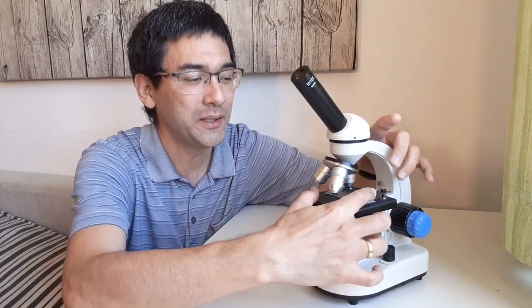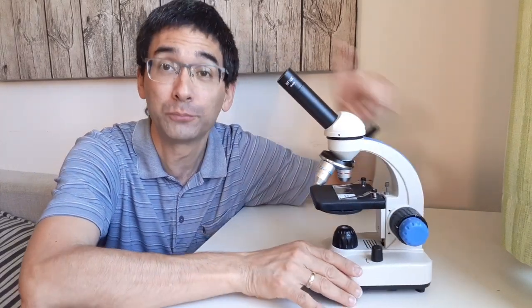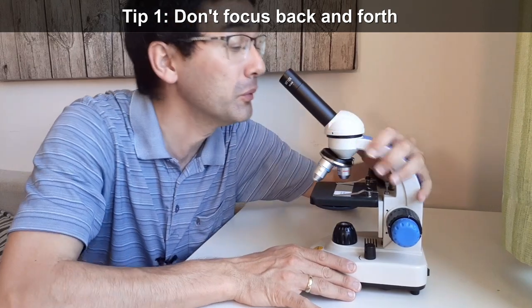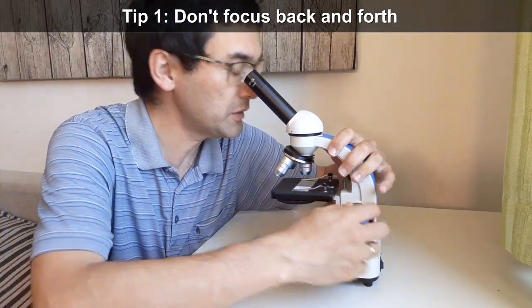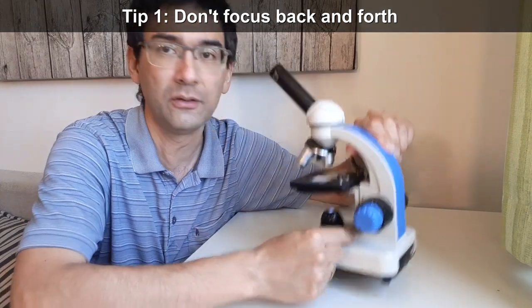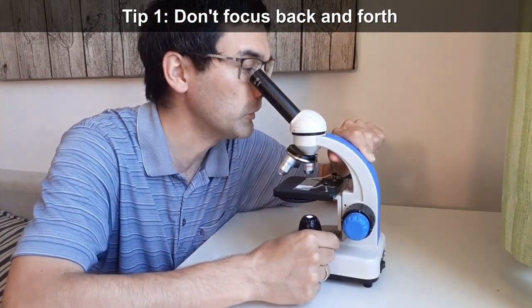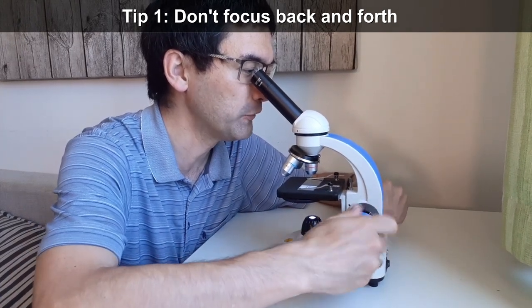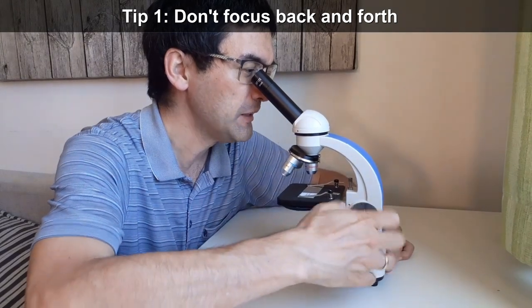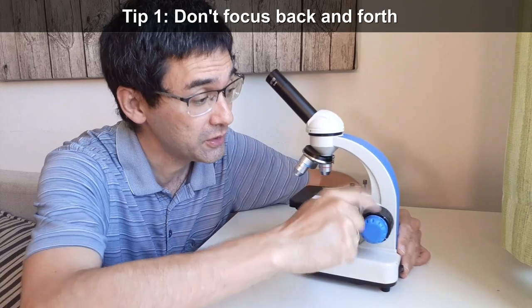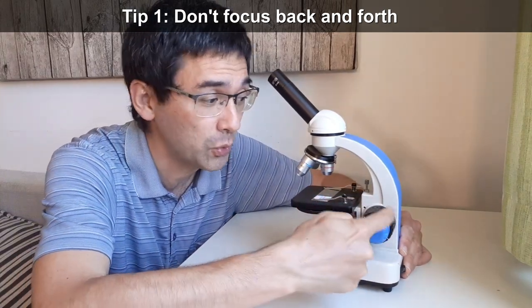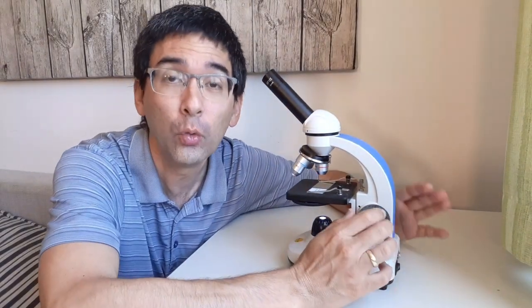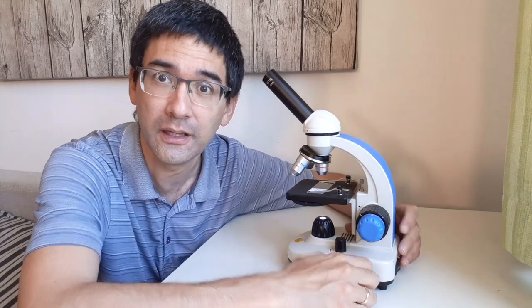And then what I'm going to show you now is problem number one that many beginners make. They look through the eyepiece here and then they turn it on and turn up the light. And then they start turning it into one direction because they want to find the focus. They cannot find the focus, so they keep on turning it into the other direction, but they still can't find the focus. Then they discover that there is also a coarse focus knob, the big one, and then they start doing this. I can't find it. And that's the wrong way of focusing.